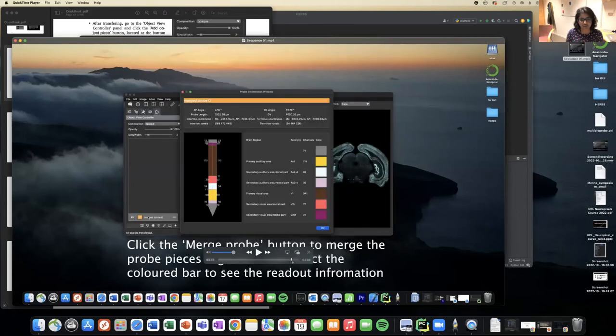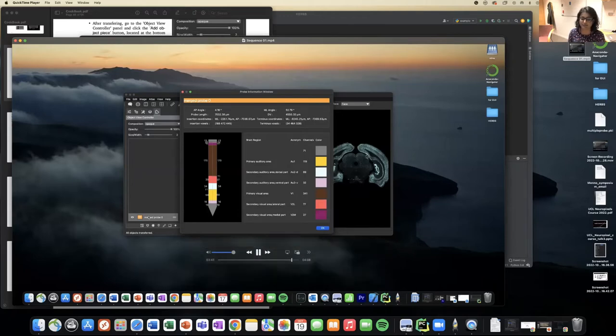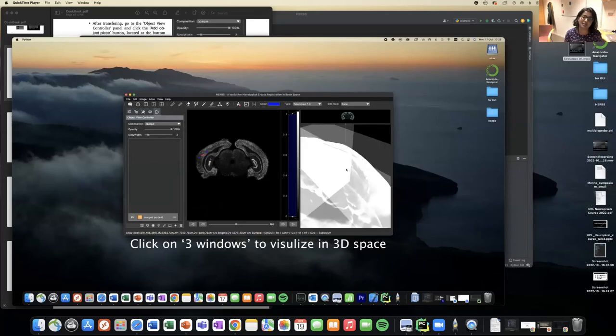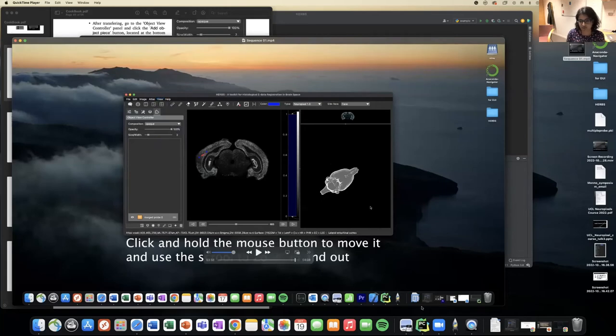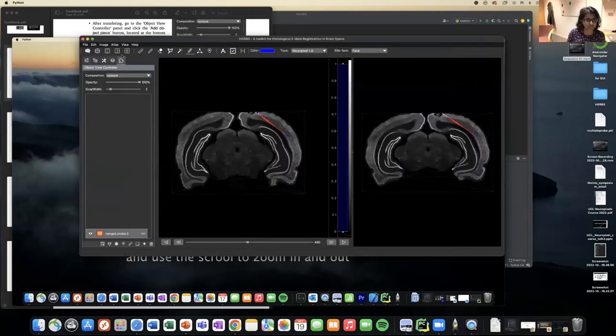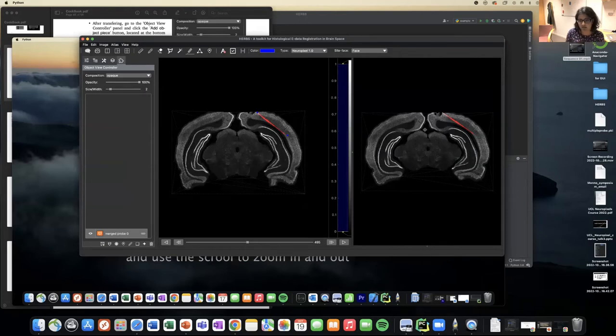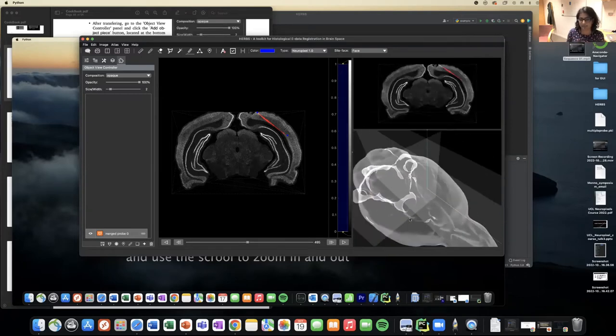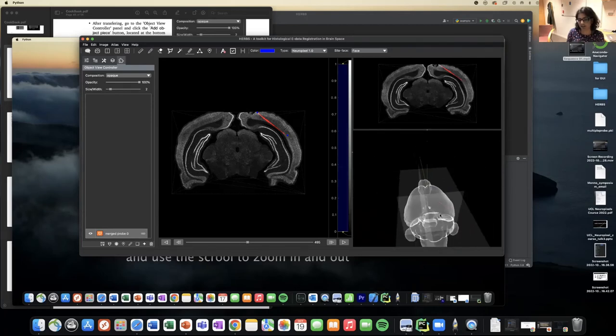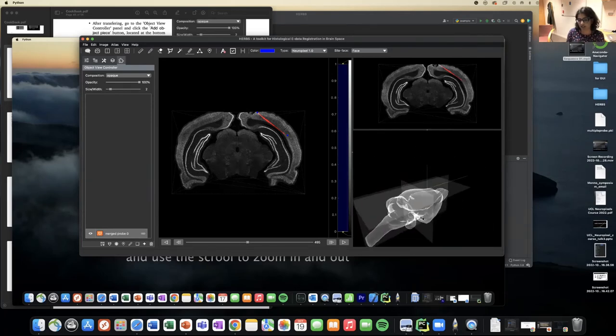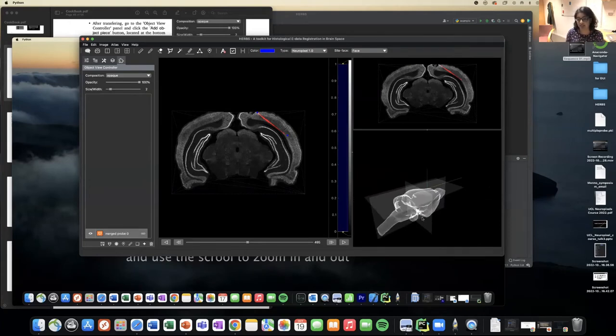Add another probe and merge it to have different slices, probes traversing through the slices. And this I didn't show you—you go to the 3D window here and you can visualize it in 3D space. And you can do similar steps for registering virus or anything that you want to put inside the brain.